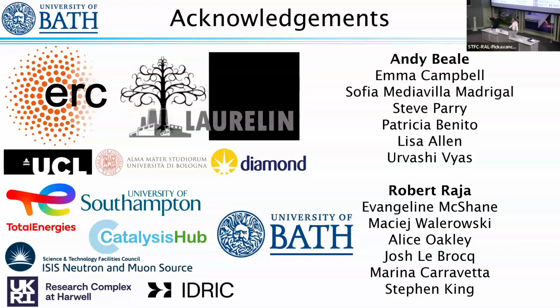Thank you. Okay, final question, Santosh. Thank you, Matt. It's a very nice talk. My question would be on the reaction mechanism from CO2 to methanol. You have seen that it's through formate, but do you also see some methoxy, and what is their role? We do see methoxy eventually, yes. So what we saw in our DRIFTS was that forming the formate is relatively straightforward, but then you need to give that formate a kick to get it to go, and that's the slow step of the reaction, activating that formate. We didn't see a lot of CO in our reaction, and that's the beauty of the indium oxide. The vacancies that we were talking about actually stop CO forming, because as CO binds onto the indium oxide, it can give up an oxygen and form CO2. So yeah.